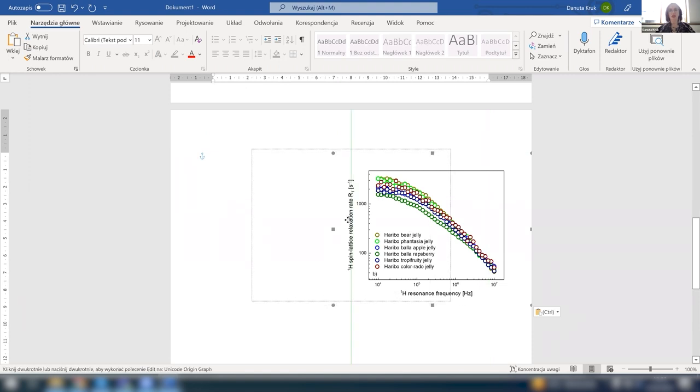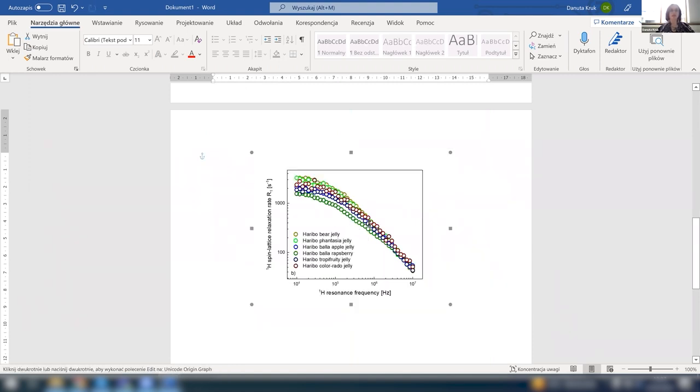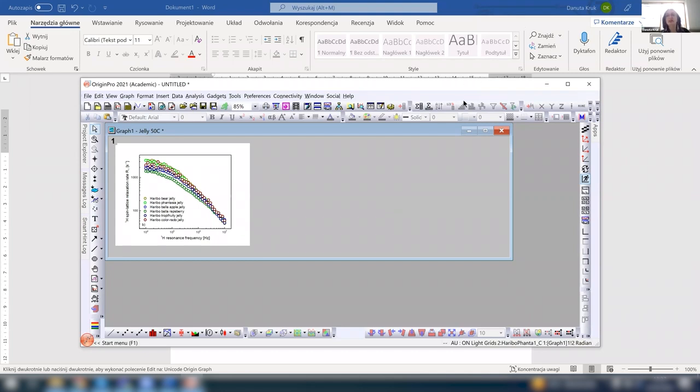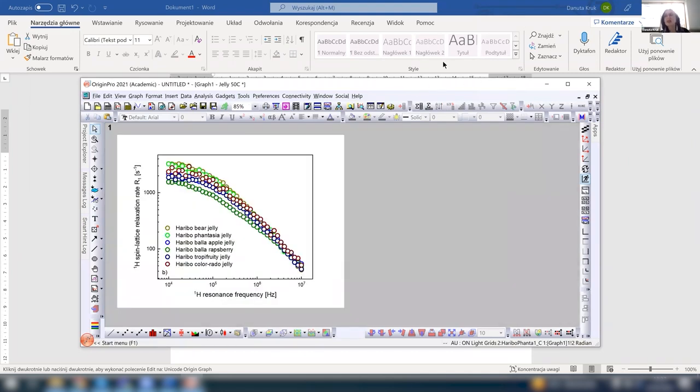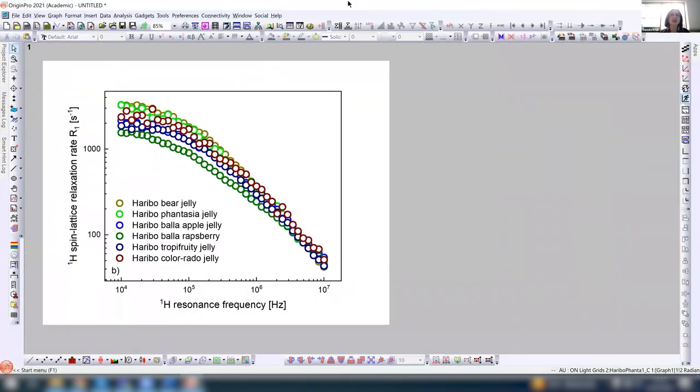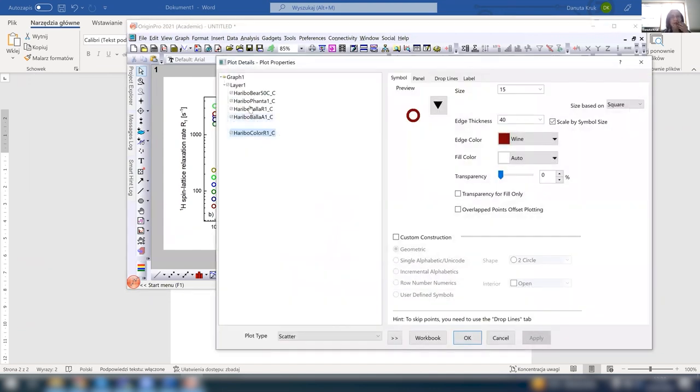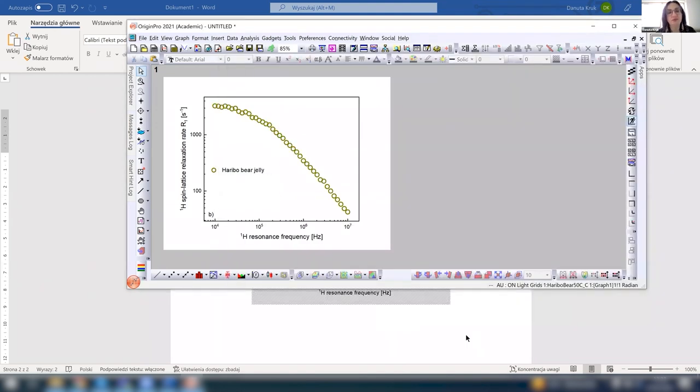Okay. So first, let me open the data. Yeah, and let me see what I can get. So it's this thing. Before I do anything, let me check the value here. It's 41. Okay.